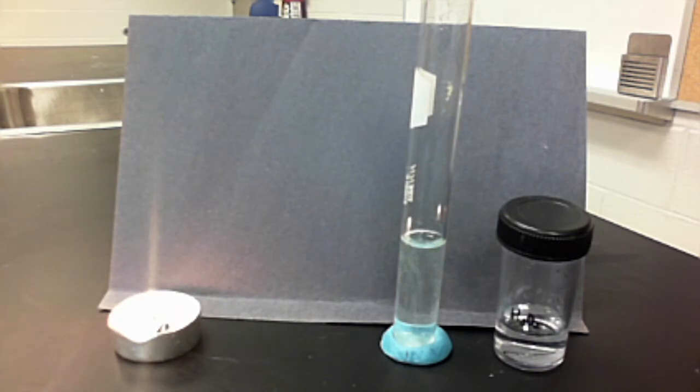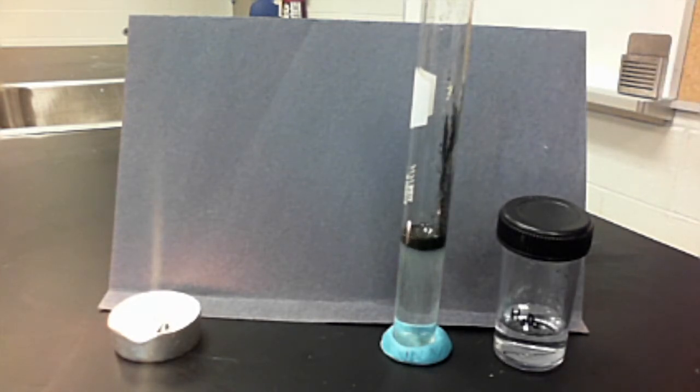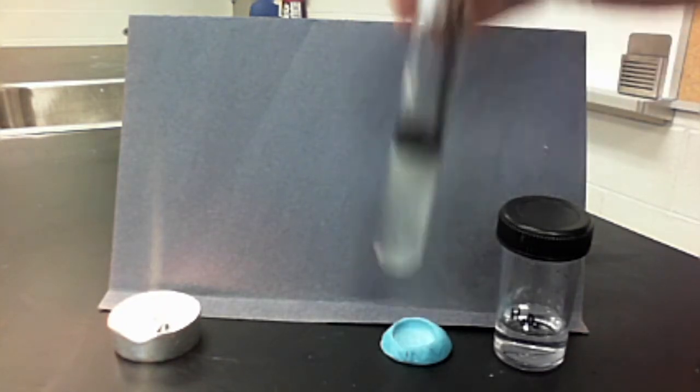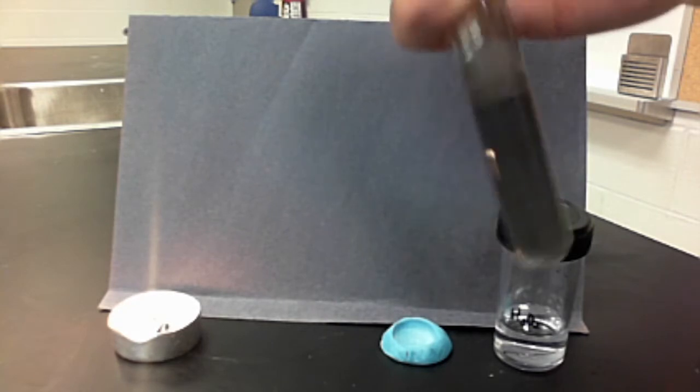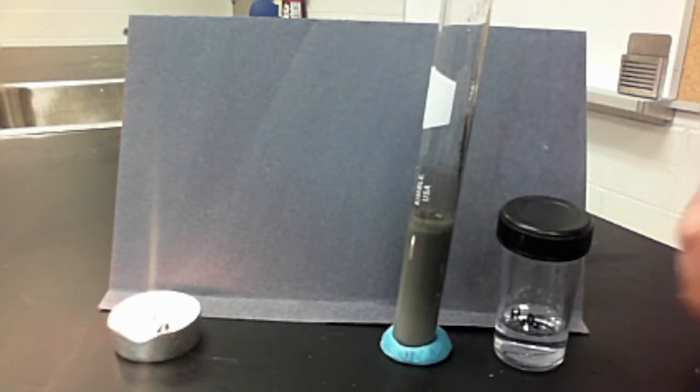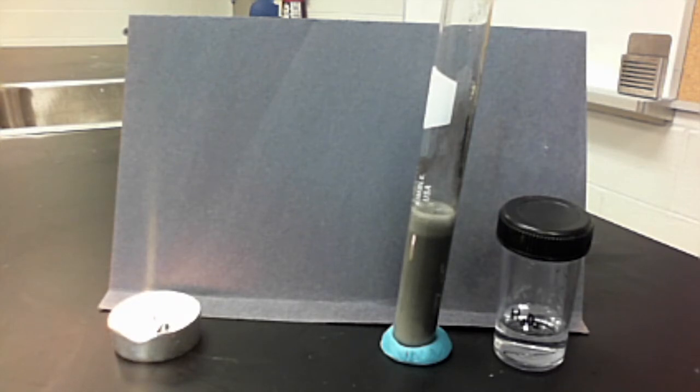I'm going to place about two rice grains of manganese dioxide into the hydrogen peroxide, and immediately you'll hear that some gas is being formed. I'm going to shake it just to speed up the chemical reaction. The manganese dioxide is not part of the chemical reaction — it just helps speed it up. It's like a speed dating service — it just speeds things up so the couples can get to know each other.